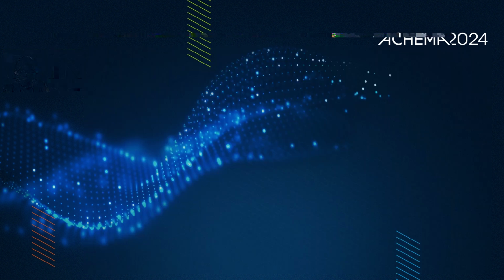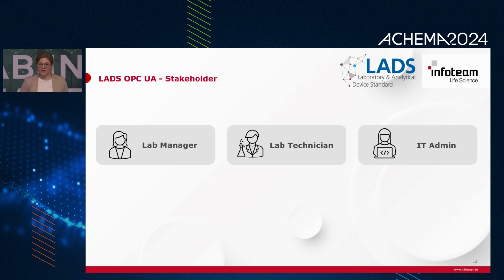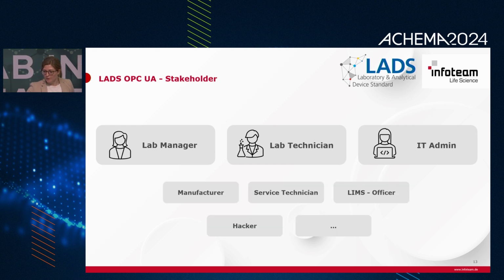So who could be interested in LADS and who benefits from it? So in the lab, of course, we have a lab manager, technicians, and maybe the IT admin of your company. But also manufacturers might be interested, service technicians, LIMS officers, or maybe some hacker who wants to steal your data. But for now, we'll take a closer look at the upper three.